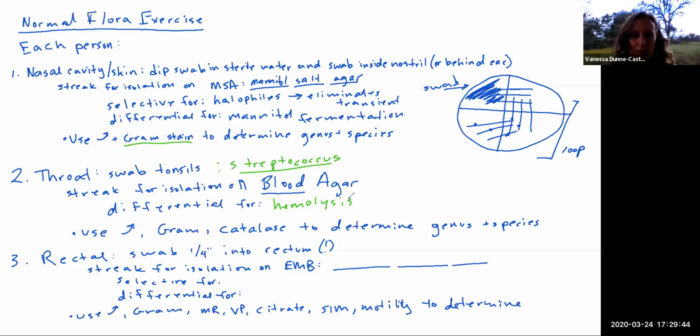And I've circled an alpha, beta, and gamma bacteria and shown you their gram characteristics and their catalase test. And with these combinations, hemolysis, gram distinction, and catalase, you can identify genus and species of many of these really common throat organisms. And there are some good discussion questions for you there.